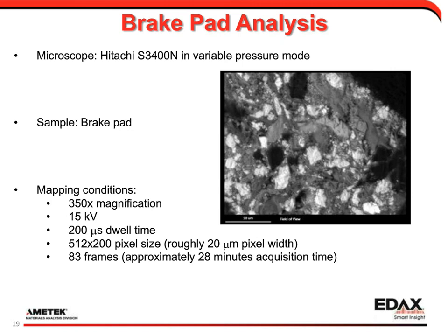And if you have any kind of contamination on top, you will get stronger attenuation in the light element range and thereby throw off your quant numbers. So the accuracy depends on the sample, how well it meets our conditions, and to which extent you have enough statistics in your spectrum. If all those things are correct, you can get quite high reliability, but you have to meet those conditions for the ultimate precision.